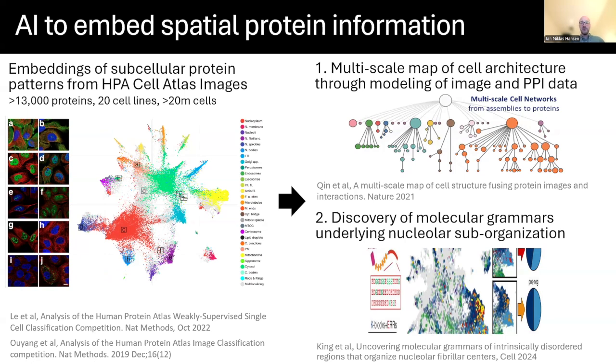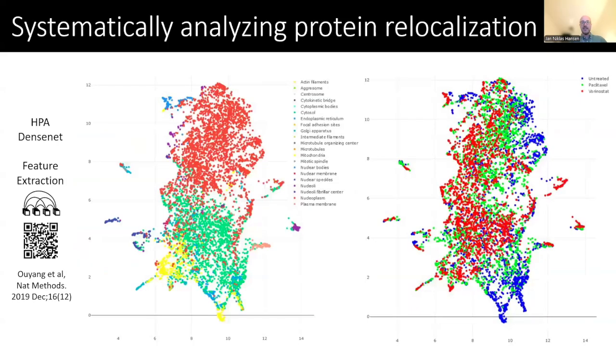So when we look at the first initial image data set of the CM4AI project on breast cancer cells, and we embed this with such an AI approach as this DenseNet that we have used to embed all the Human Protein Atlas images, then it looks like this. We see how in this UMAP the features spread out different fields of view, or different images, in the embedding space.